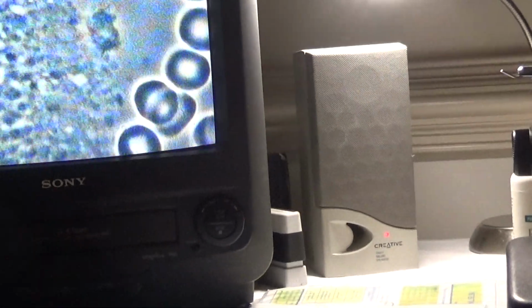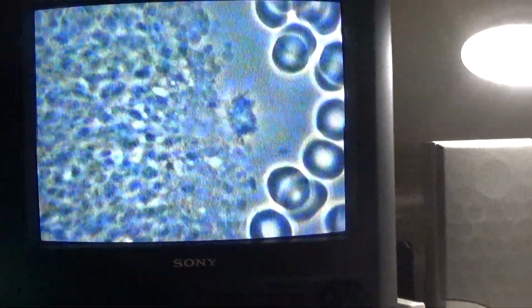Cell wall deficient dominant. So around this part right here is primarily these cell wall deficient forms. Now Borrelia in its classic form looks like this. It's a long, thin spirochete. It has a very tight spiral shape. It's hard to perceive the spiral nature of it. It doesn't look like a spiral staircase.